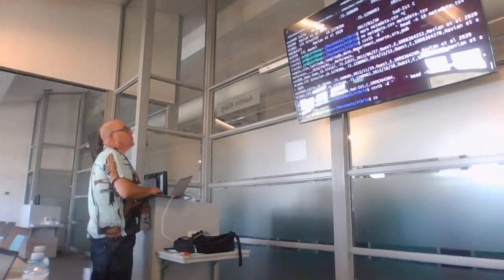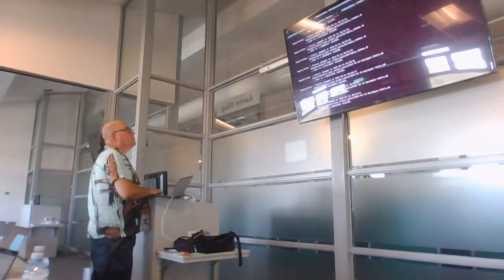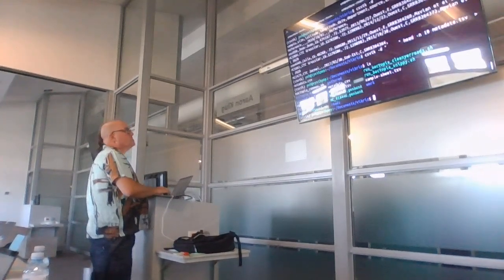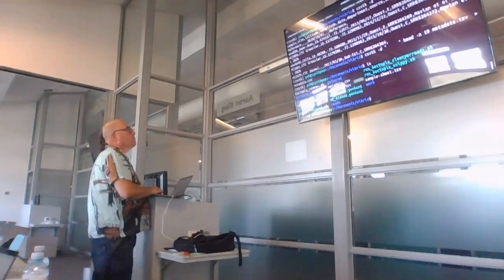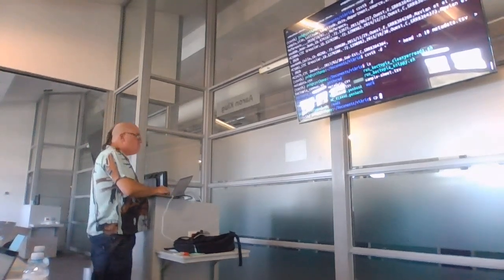So the end result of this was that, let's just see which window I have this in. Oh, wait a minute, it wasn't my other working directory. I'll find my way around this again, just a second.